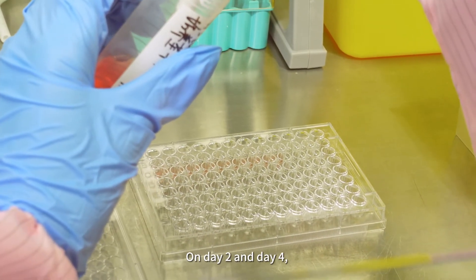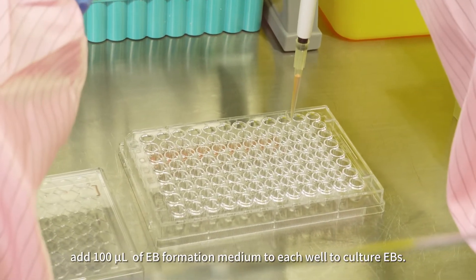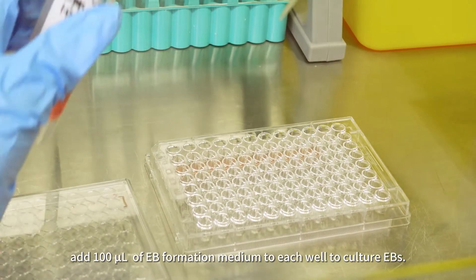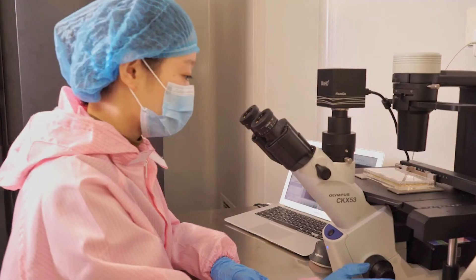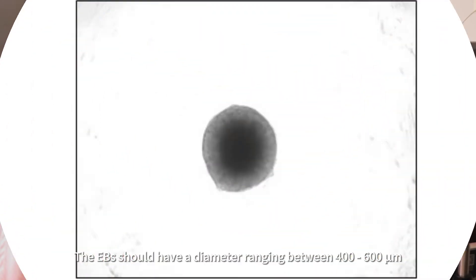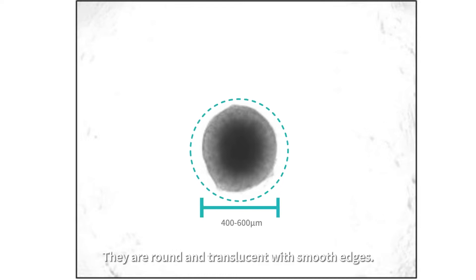On day 2 and day 4, add 100 microliters of EB formation medium to each well to culture EBs. Observe under a microscope. The EBs should have a diameter ranging between 400 to 600 microns. They are round and translucent with smooth edges.